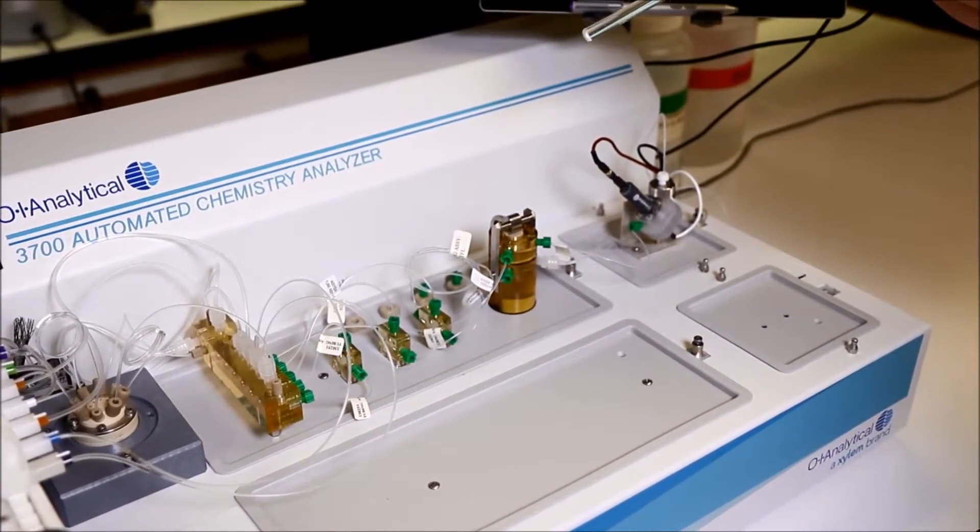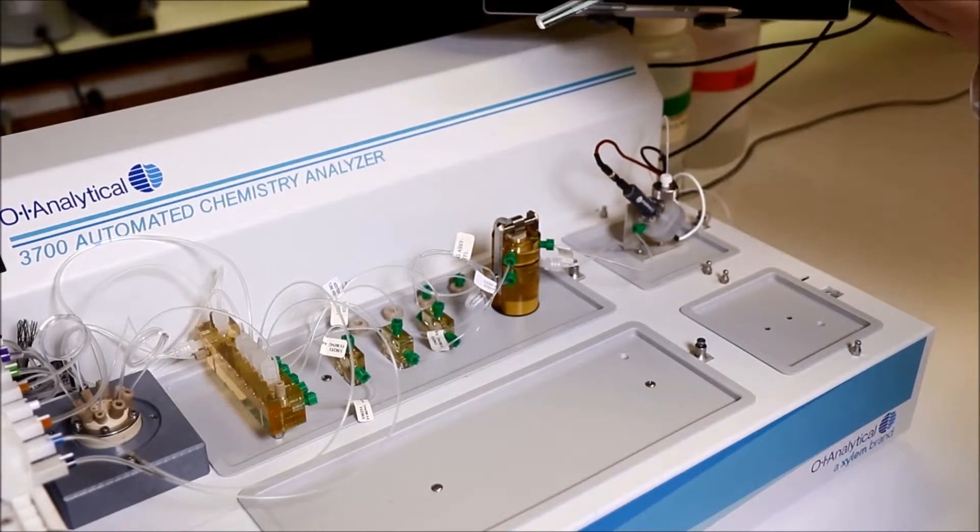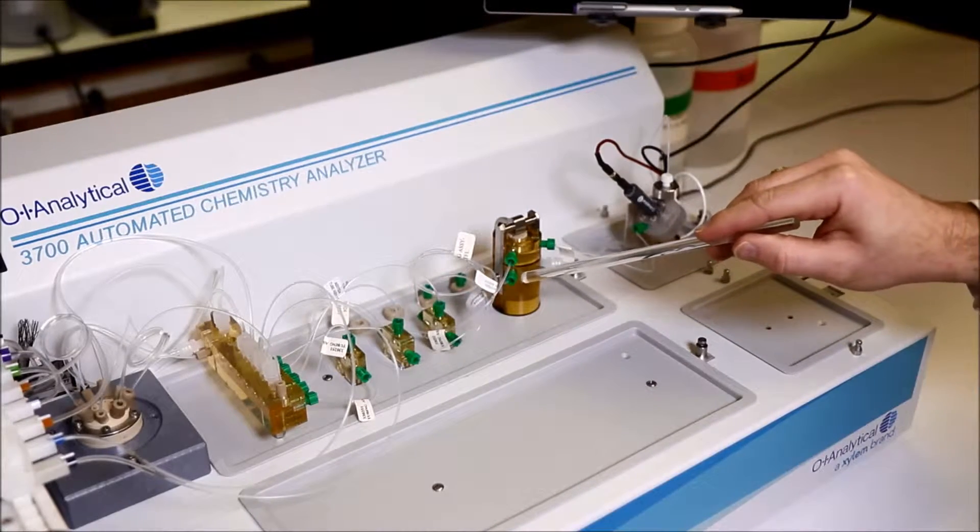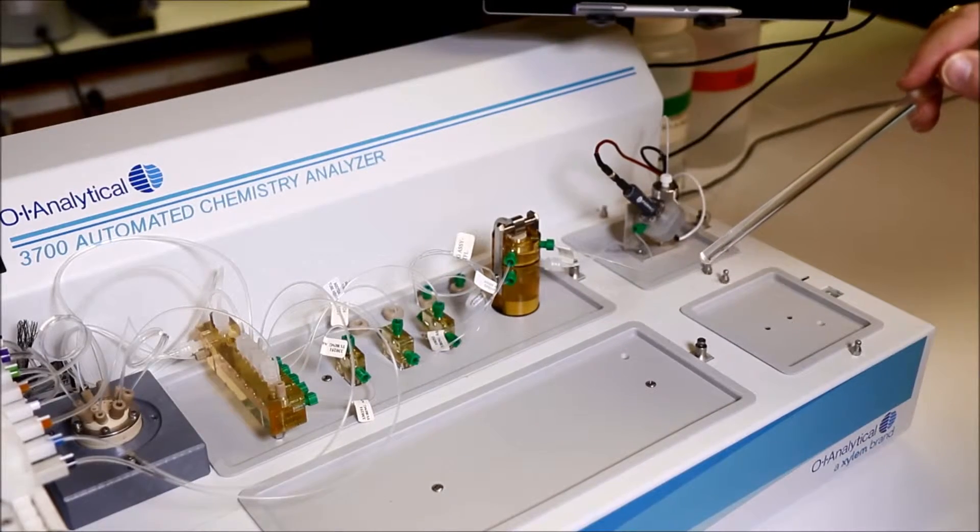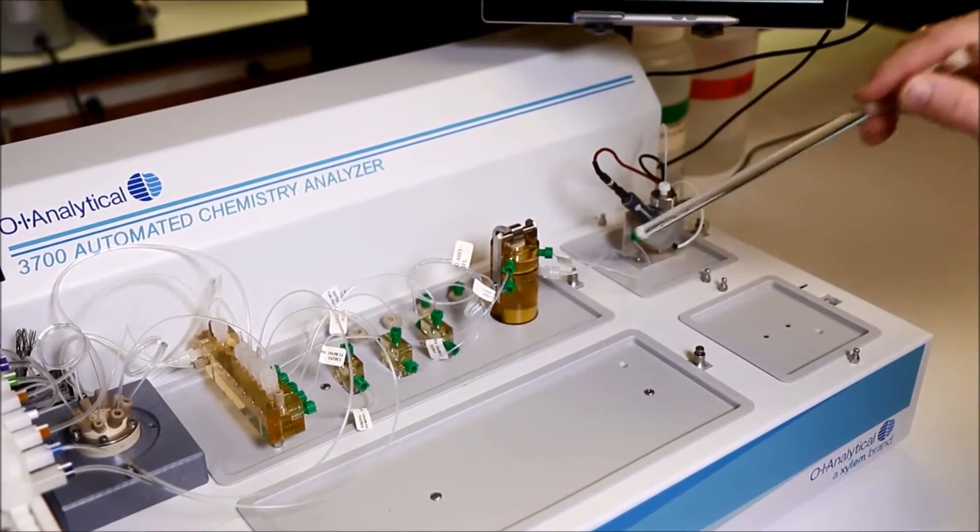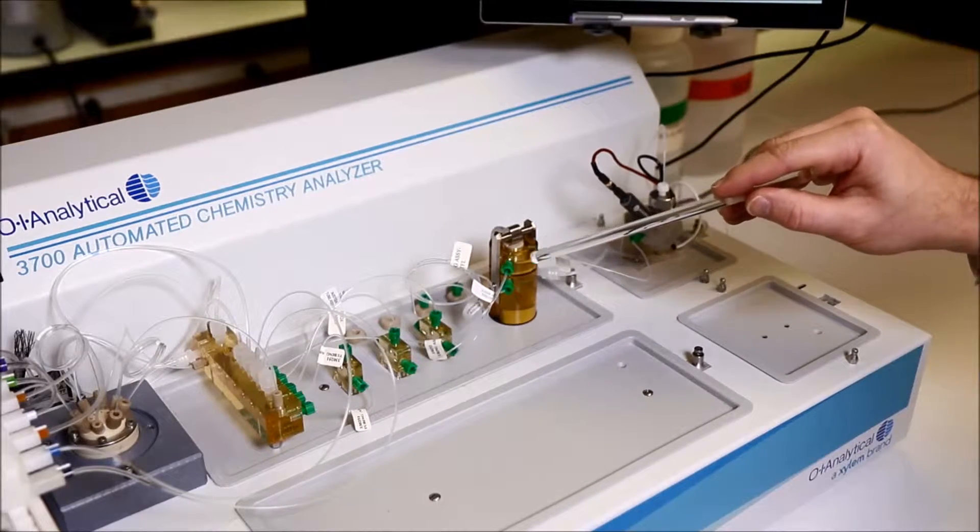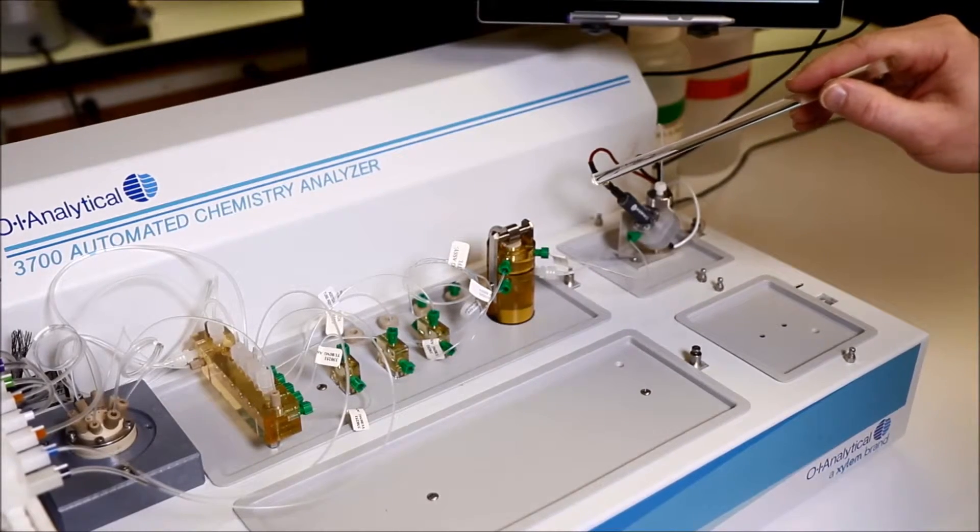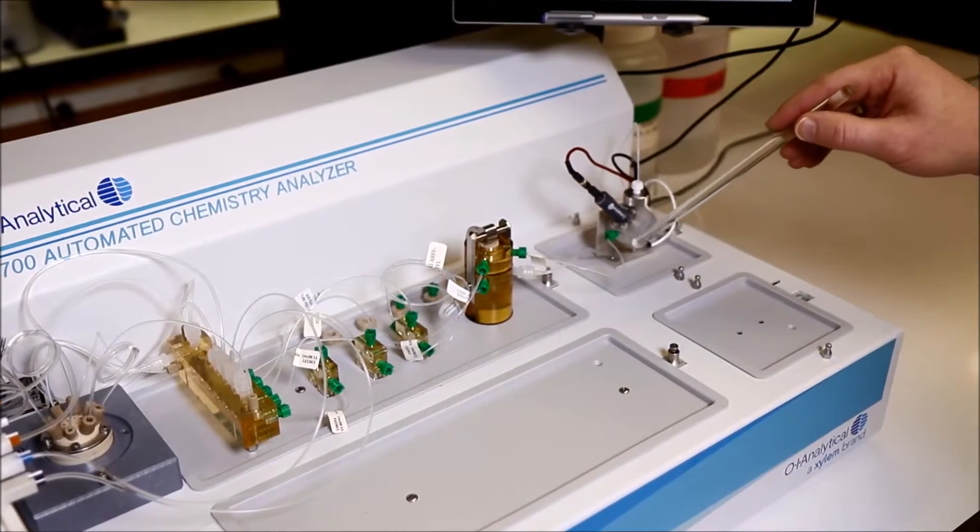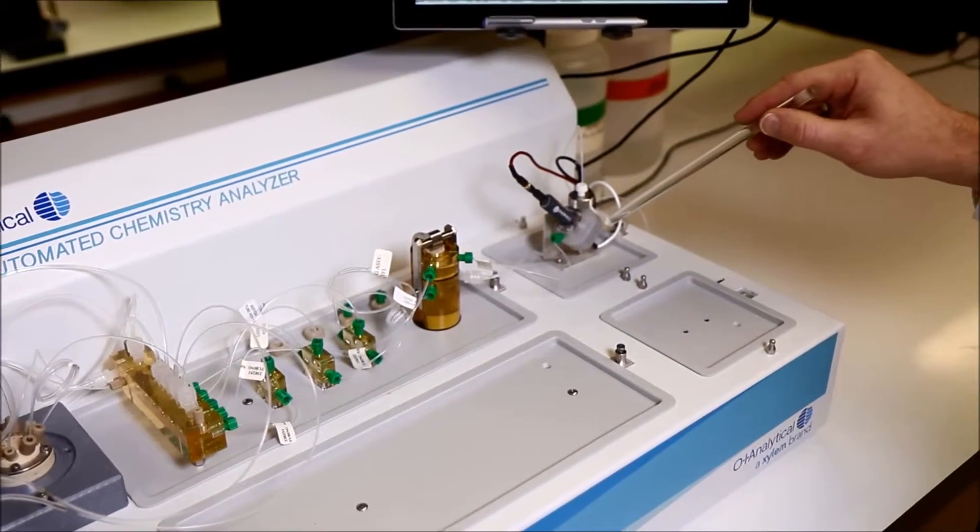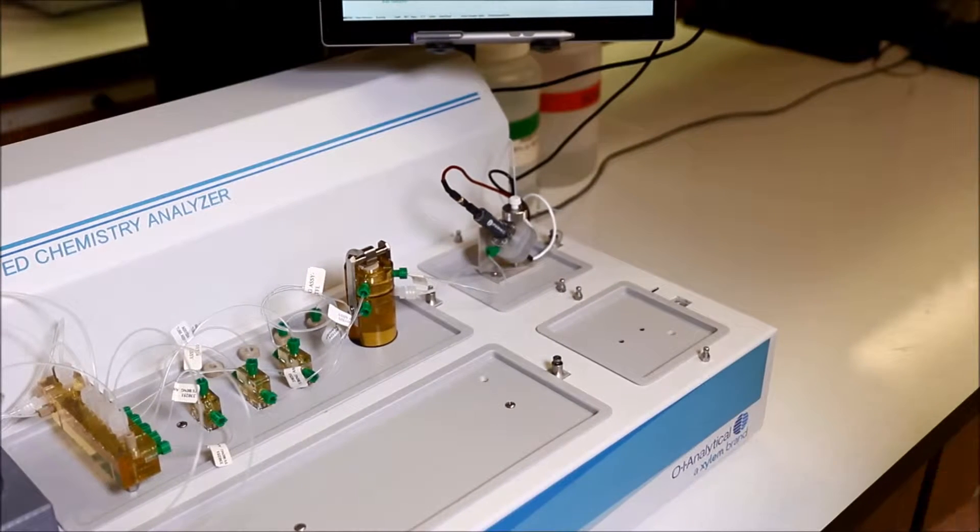After the metal cyanides have been disassociated, TA2 is added. The acidic sample stream passes on the lower side of a gas diffusion membrane, allowing cyanide to pass across into an alkaline receptor stream, which is then flowed over to the amperometric cell where the cyanide is measured directly.